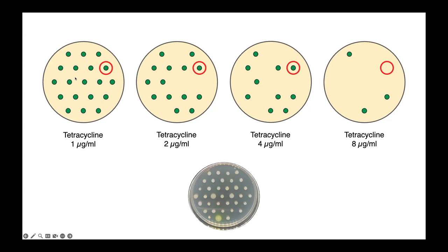So if we start with our very low concentration of tetracycline, one microgram per milliliter, and focus on this colony here, you can see that we have growth on one, two, and four, but not eight micrograms per milliliter of tetracycline. And so in this case, we would have a minimum inhibitory concentration, or MIC, of eight micrograms per milliliter.